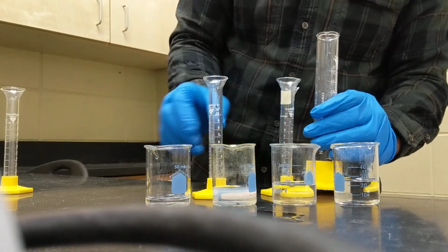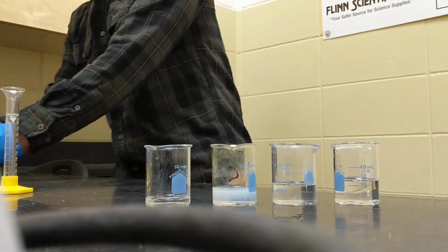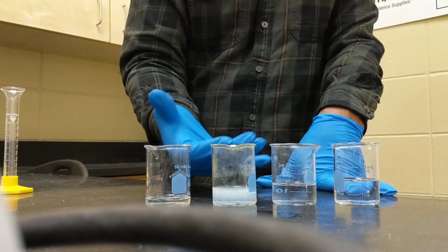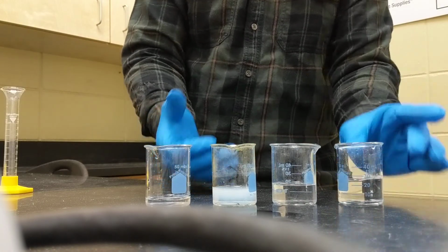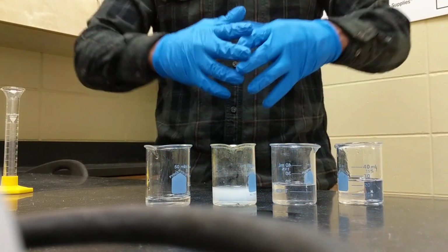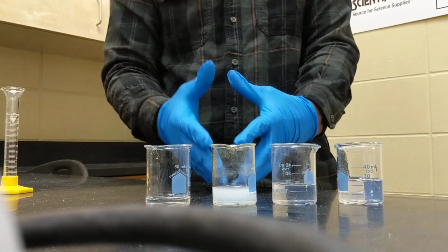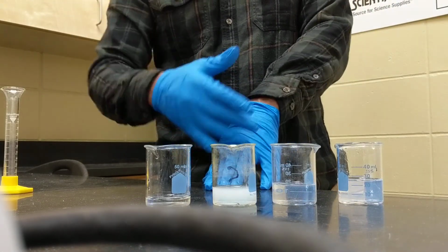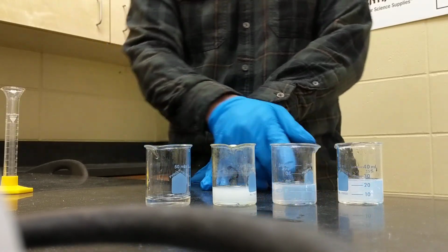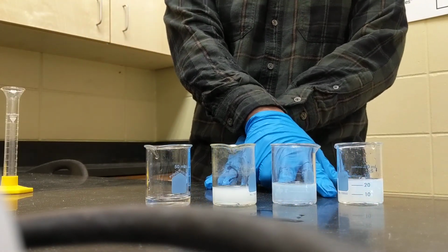Now, if you aren't noticing, this first one is already beginning the process of reacting. You can tell that it's reacting because it's becoming cloudy, it's becoming opaque. And that's just a reaction of the sulfur ions forming that solid that's cloudy in water. It's also going to form a sulfur dioxide byproduct as well. And we've noticed the other two have become cloudy as well.